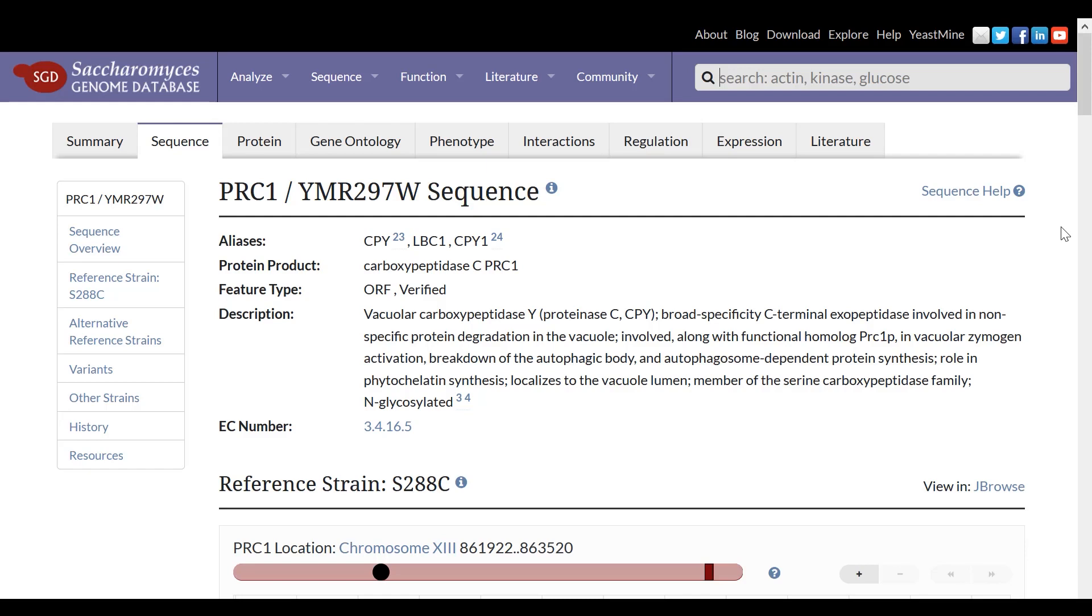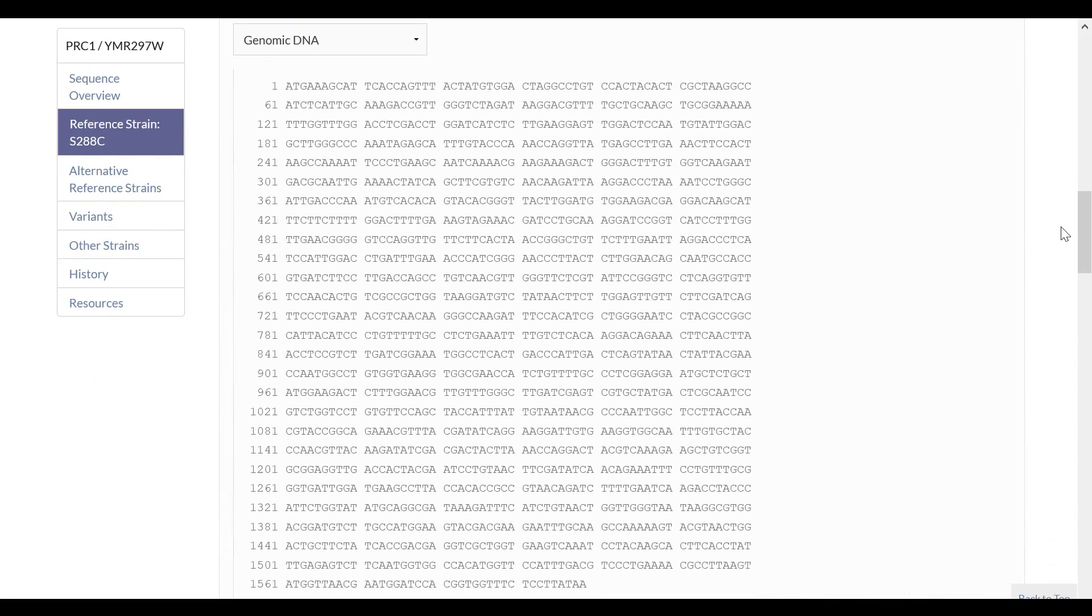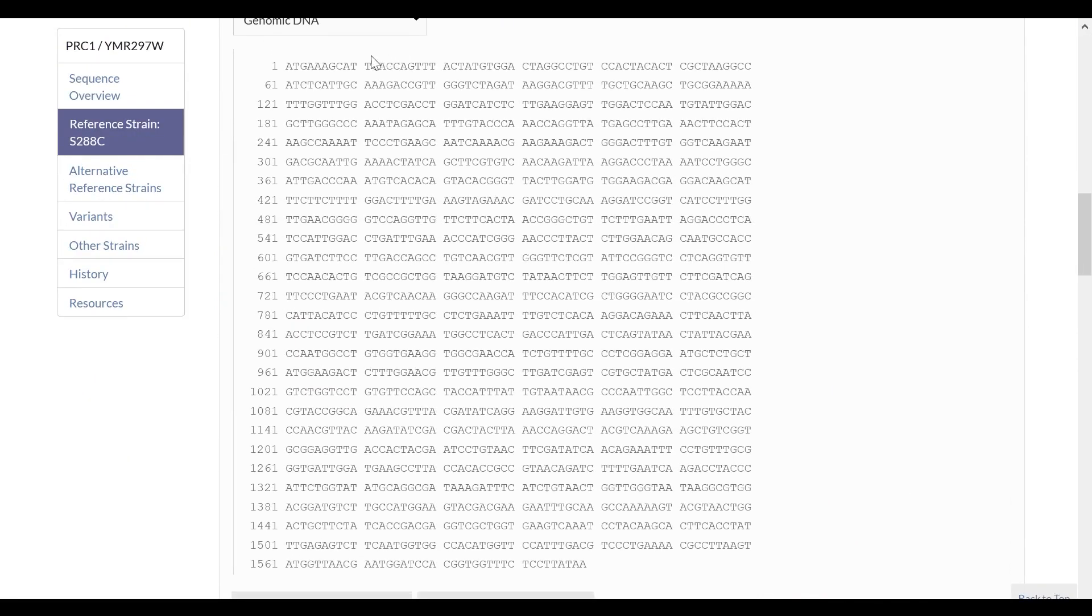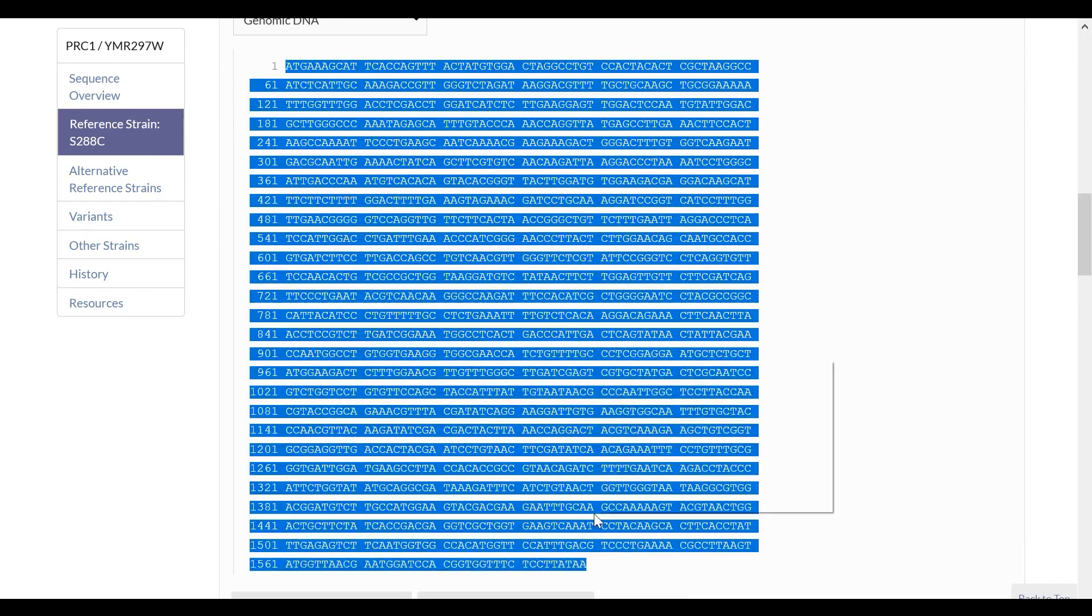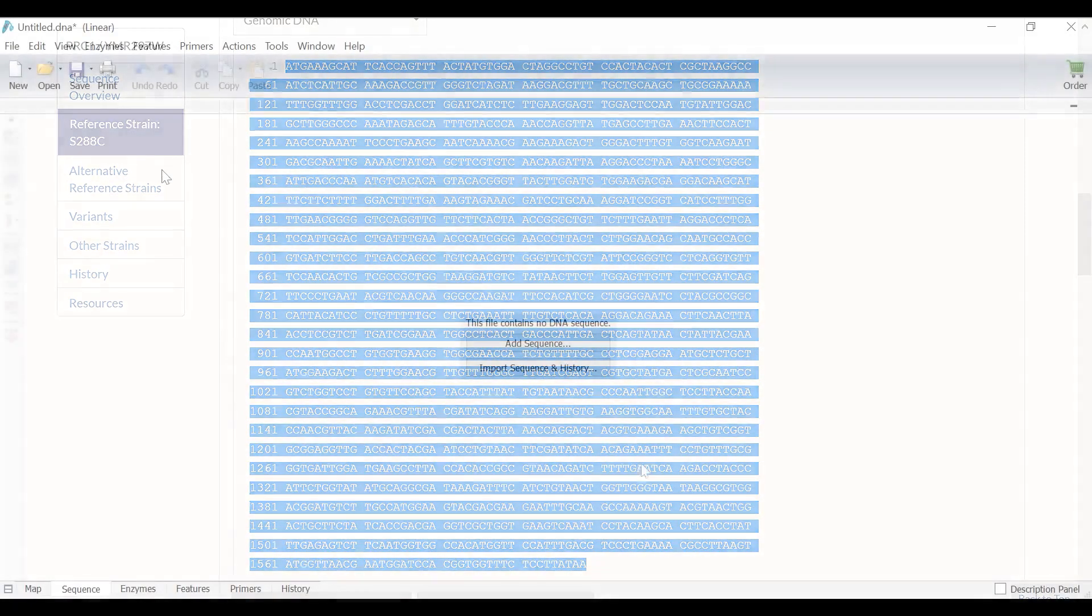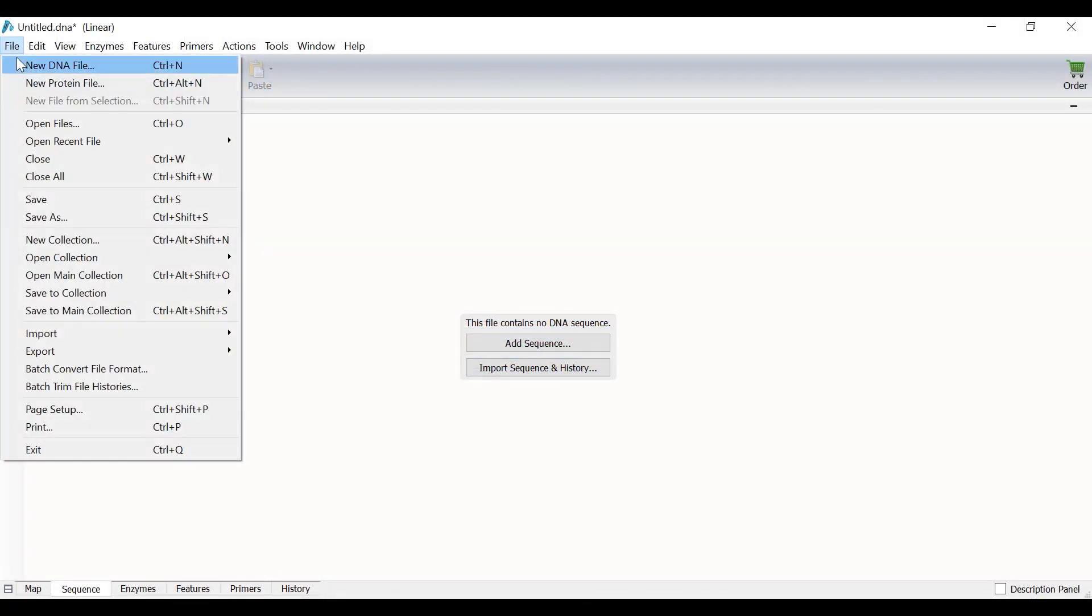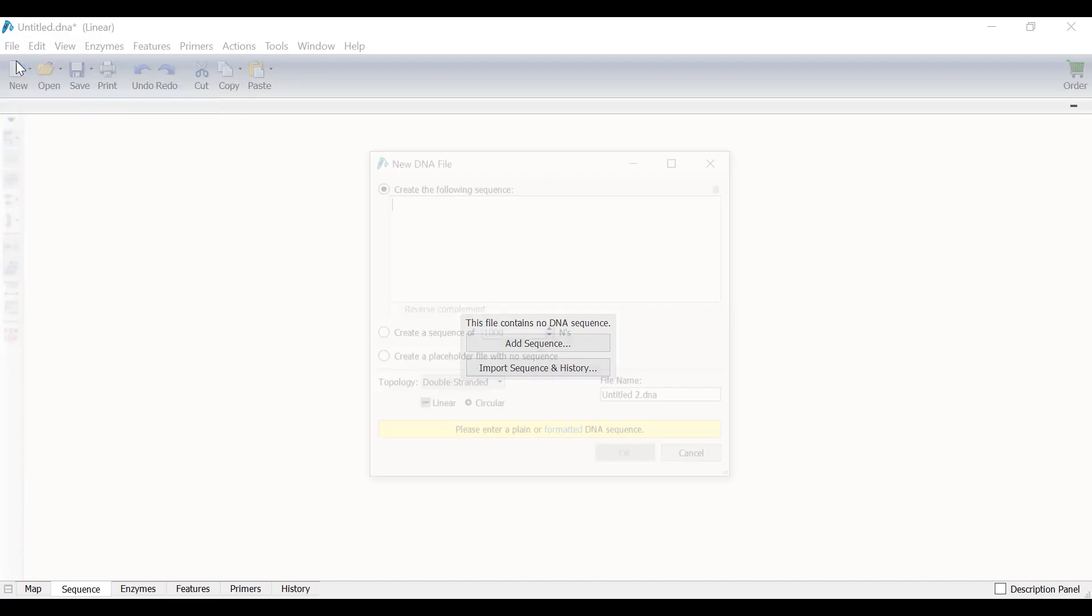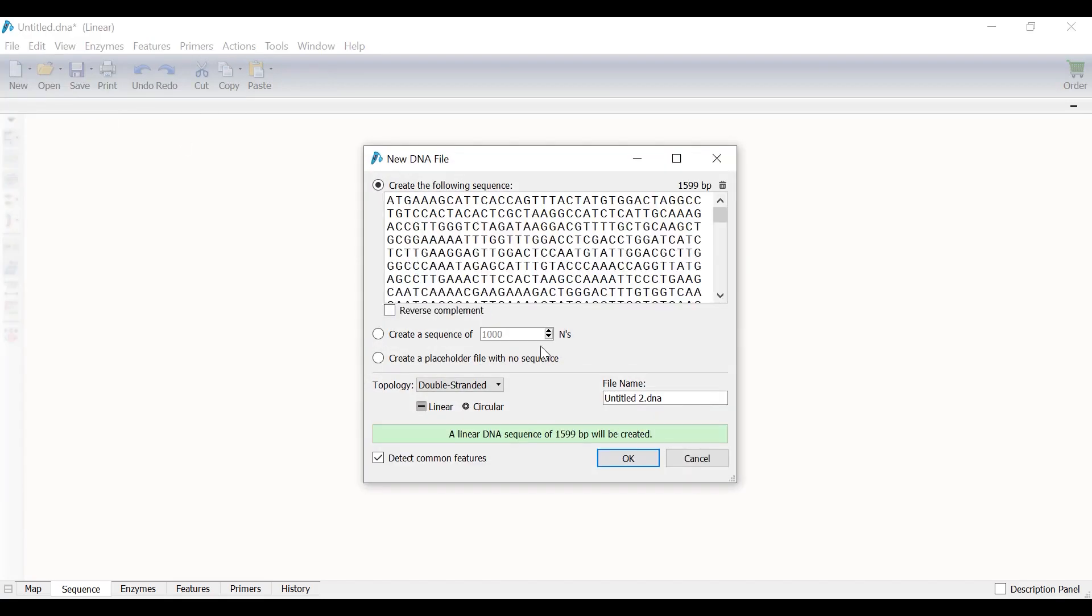For this example, I will work with the yeast gene known as vacuola carboxypeptidase Y, or CPY for short. I will copy the sequence from the yeastgenome.org online database and open the Snapgene window. To add the sequence in Snapgene, I will go to File, New DNA File, then I will paste the sequence in and select OK.